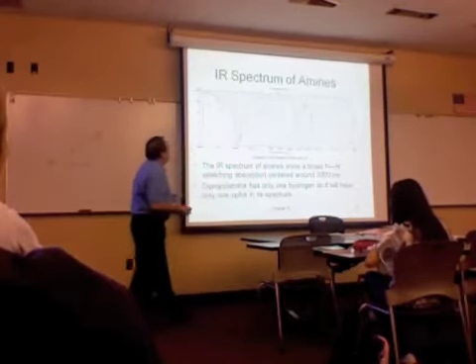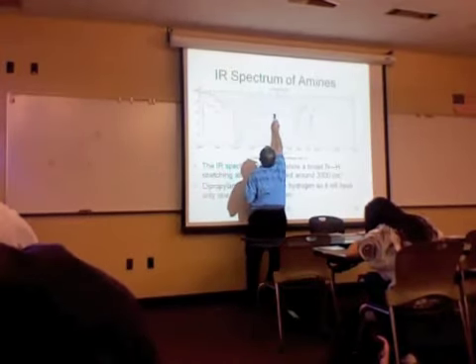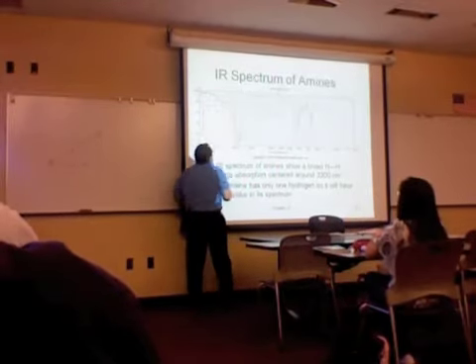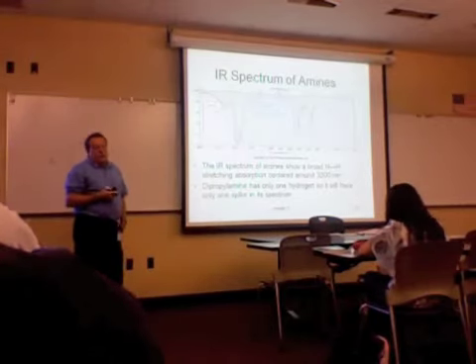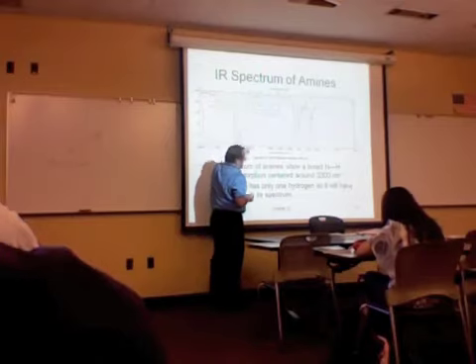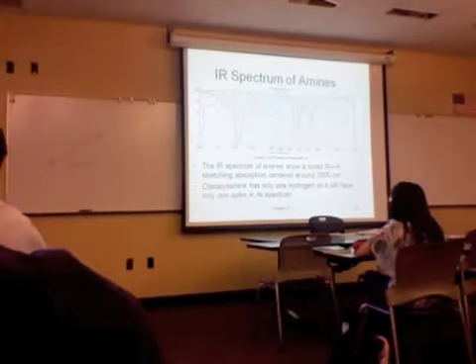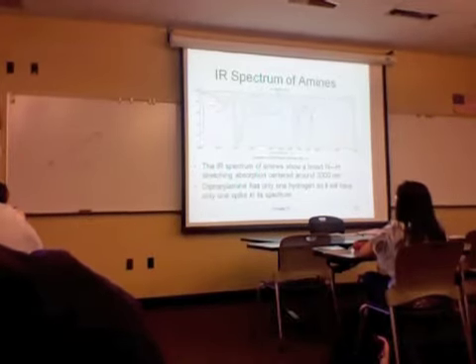Okay. Here's an amine. This is a secondary amine with a single hydrogen on the nitrogen, and we see a single spike on kind of a broad hump. The amine is also hydrogen bonded, not quite as strongly, and so we see a generalized effect. But because some of the amines are not as strongly involved in the hydrogen bonding, you'll usually see a spike for each hydrogen present. And so amines often look kind of ugly, and people will maybe run their infrared again because they're thinking they've done something wrong, because it doesn't look like what they expect to see.